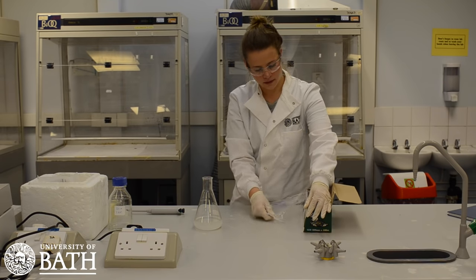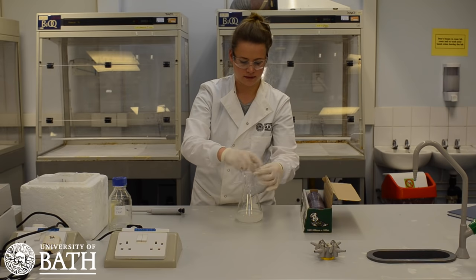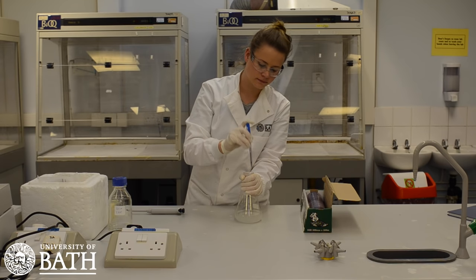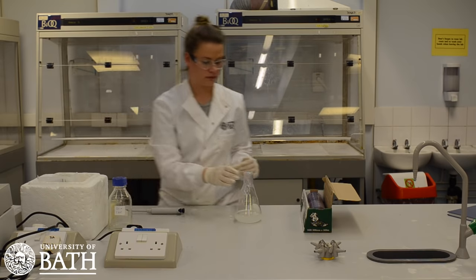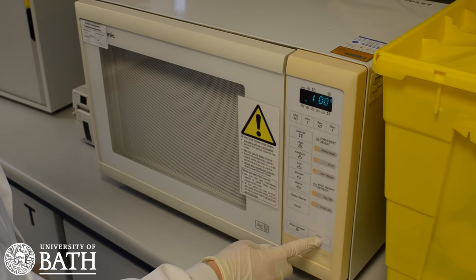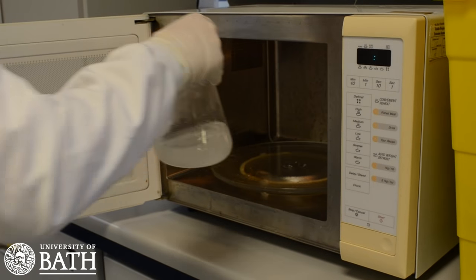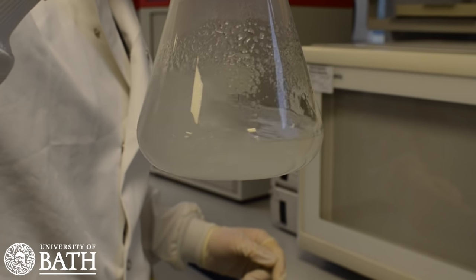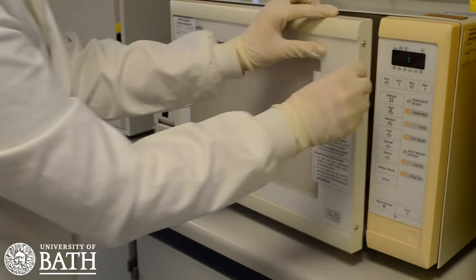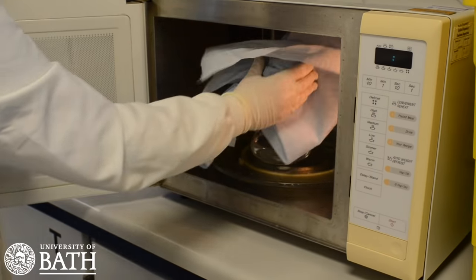To prepare the agarose gel, this mixture will need to be boiled. Therefore, in order to minimise evaporation of TAE during this process, wrap cling film over the top of the conical flask twice and pierce with a sharp object. The mixture is now ready to be placed into a microwave. Put it in the microwave for 1 minute and at the end of the minute, check to see whether the mixture has become transparent. If it has not, put it back in the microwave for another minute and continue this process until it has. Note that the conical flask can get hot during this process and something may be needed to protect your hands from the heat.